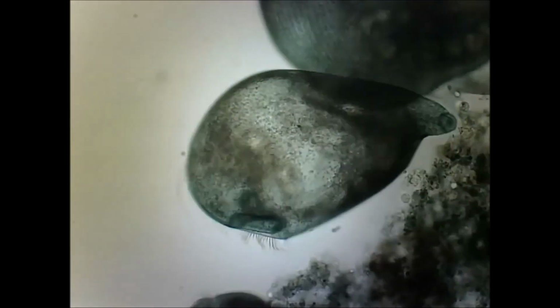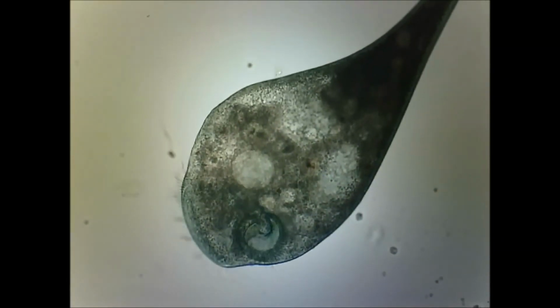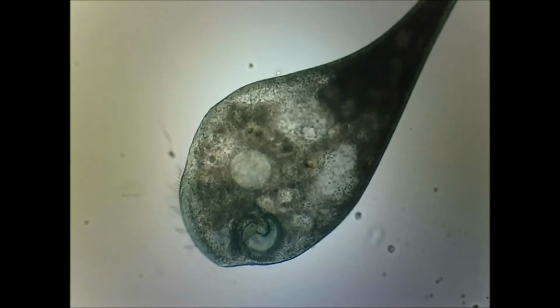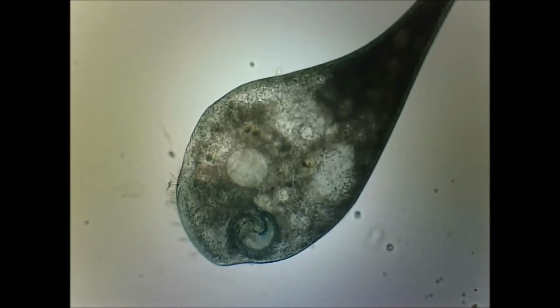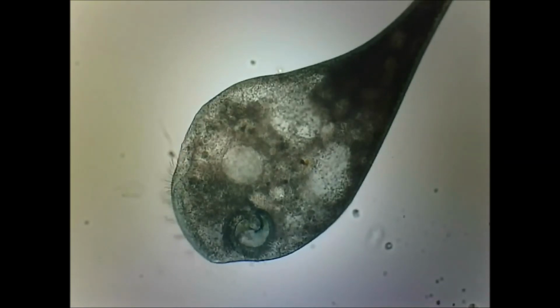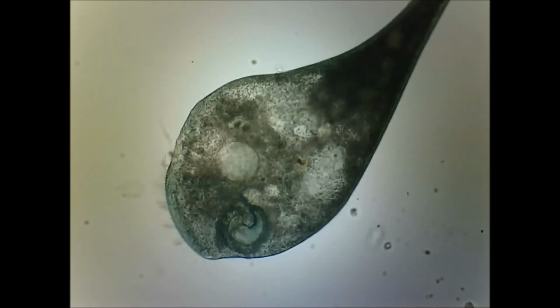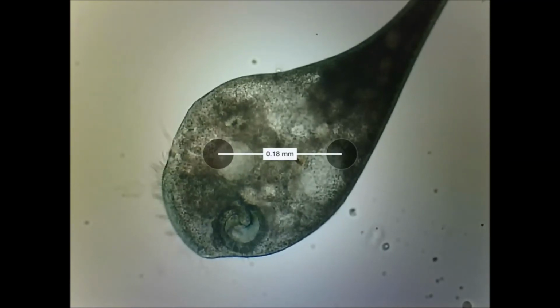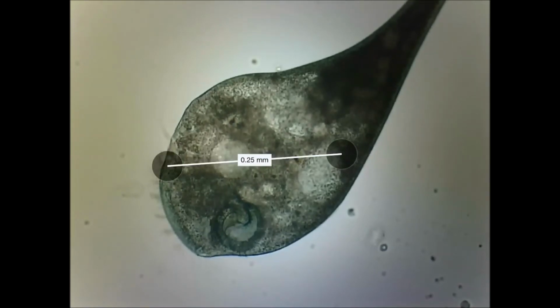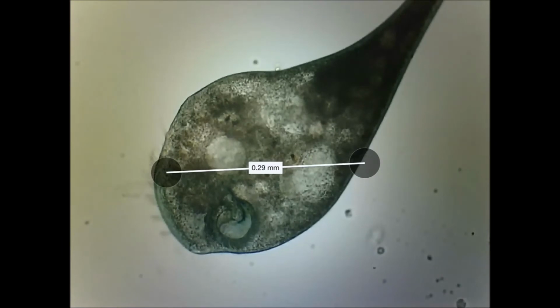We also can see the buccal funnel there, and we're going to see it even better here. Here you can see it very clearly. It has cilia beating to draw food into it. You also, on the left edge, see cilia, which are also helpful in locomotion. Above the buccal funnel, you see a large circular spot. That large circular spot is a water vacuole, and it will get rid of water over time. And here you take a quick measurement, and you can see across the body of the cell here, it's just under 1/3 of a millimeter in size.